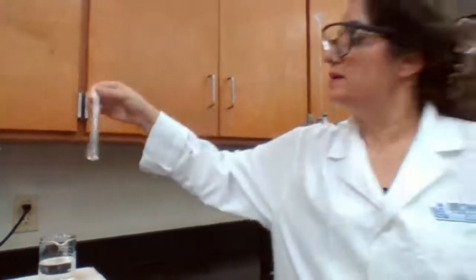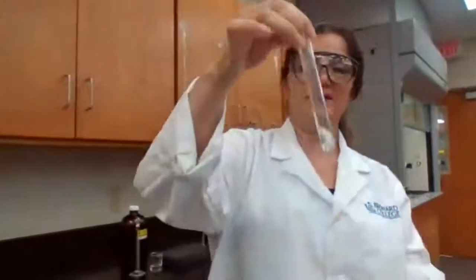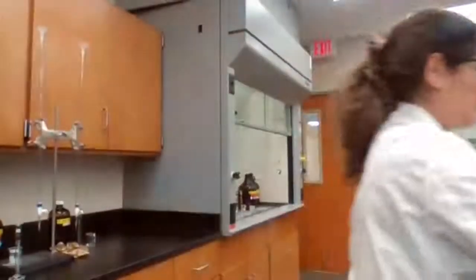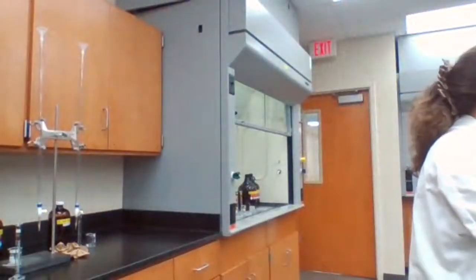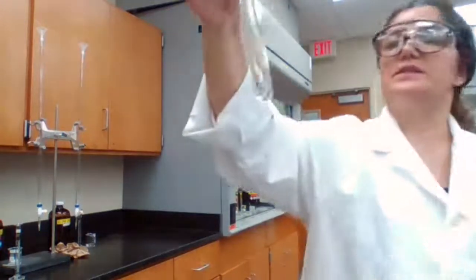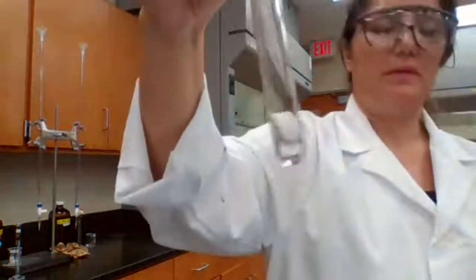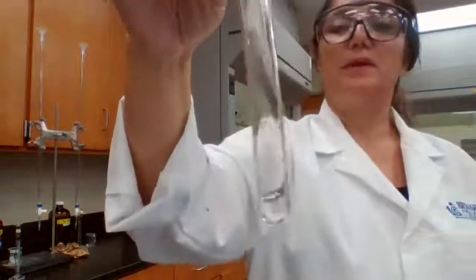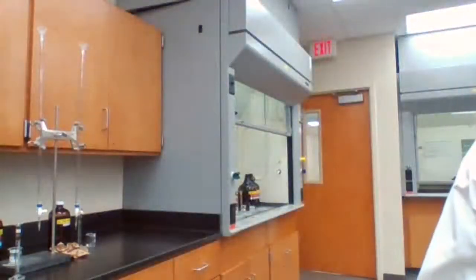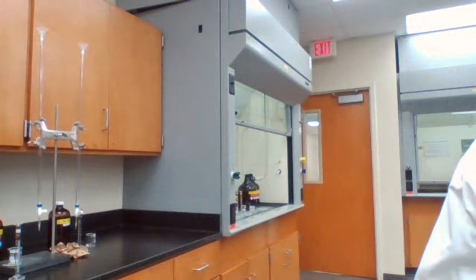Going to take it, cool it down, and place it in the ice bath. So this is what your observation is going to be. Nothing happened. It is a clear solution. Place in the ice bath.